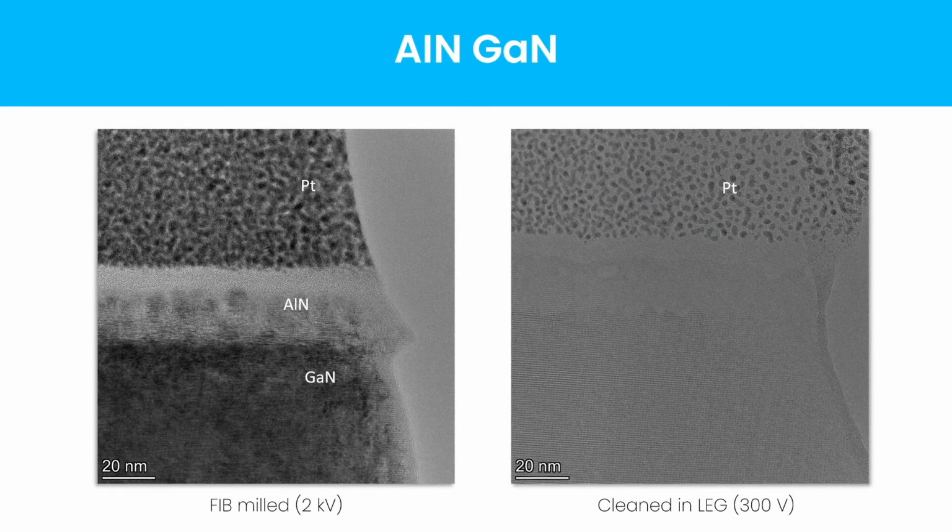And if I show you the high resolution images, the raw lamella was actually finished at 2 kV. You don't see much amorphous band here. This is almost all crystalline, but the quality is not really good, partly because of the thickness, but also because of the damaged crystal layers on this sample. The aluminium nitride layer is visible here, but its structure is not really revealed.